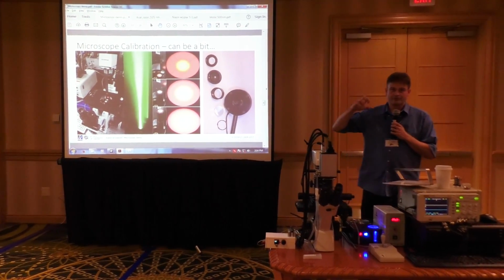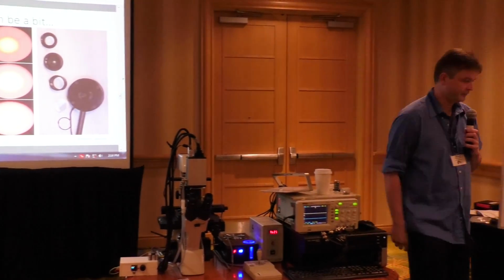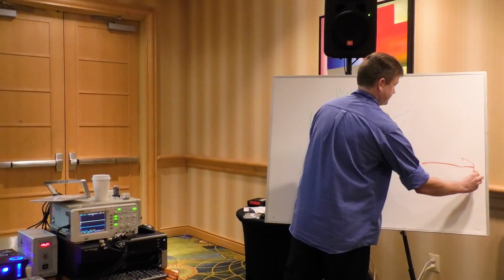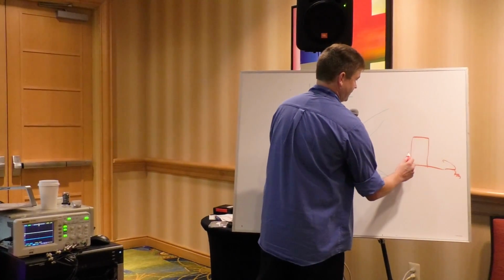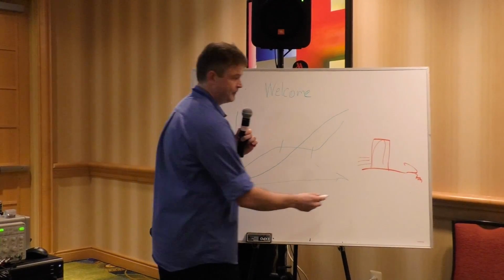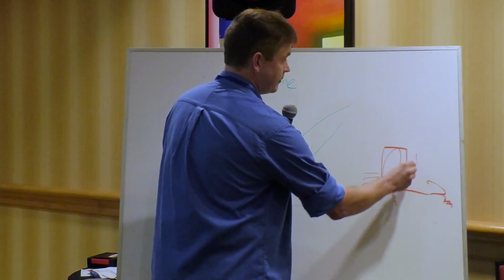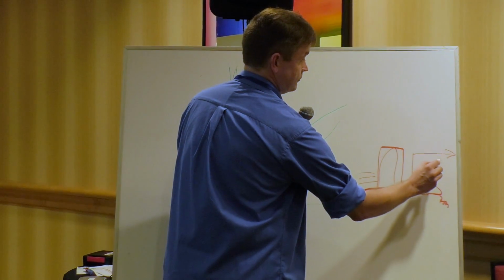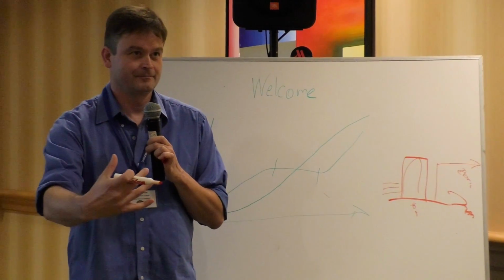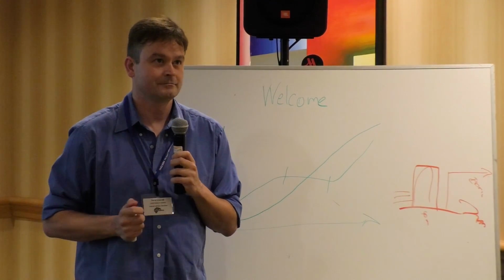Now, your objective will not release that easily. And there's another problem. This microscope here has a bandpass filter, right? Bandpass filter is something where you have a function like this, and everything out here is blocked, and the light in here you take. But they have bandwidths, normally 40 nanometer. Yeah, there are filters that are called long passes. This can easily be 200 nanometer. So the light changes its color. It's one of the big problems in measuring light.